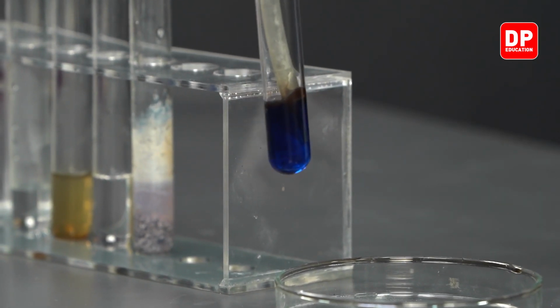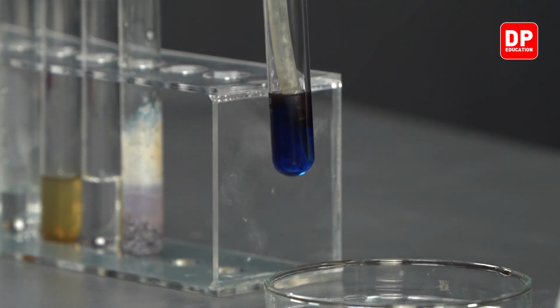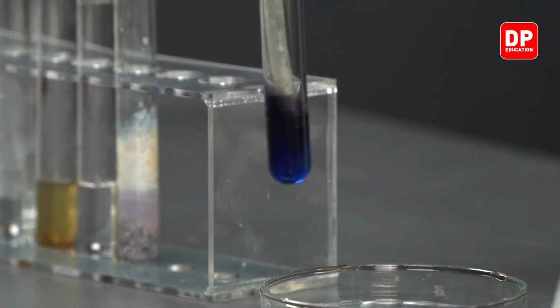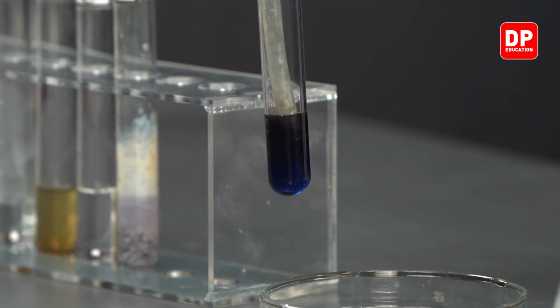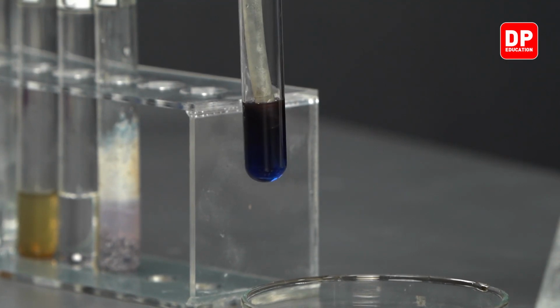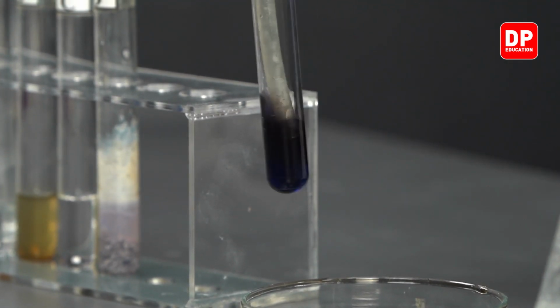And as you can see, when the gas comes into contact with the cuprous chloride, the color of the cuprous chloride begins to change little by little.